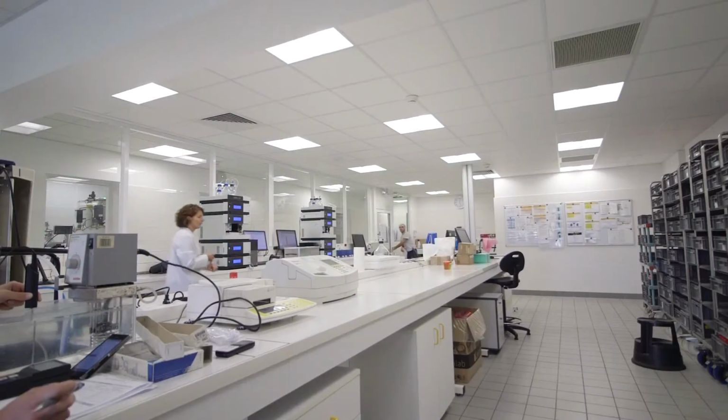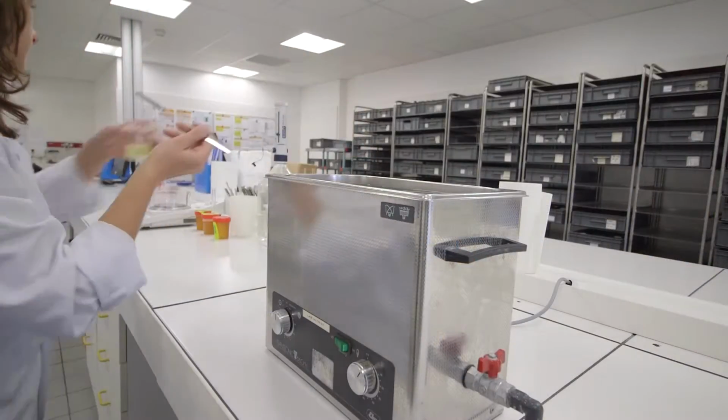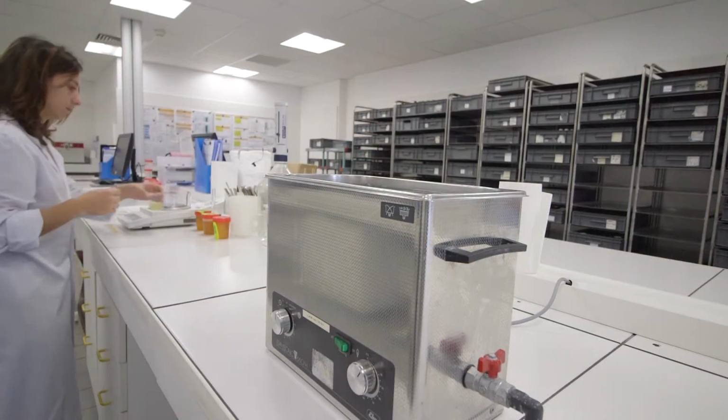The second reason for rejection is false botanical and geographical origin. Sometimes you can have on the label acacia honey from Hungary mentioned. When we analyze it, it is not complying. It could be a polyflora, not coming from Hungary, but for example, coming from China. So this is the second reason for rejection.